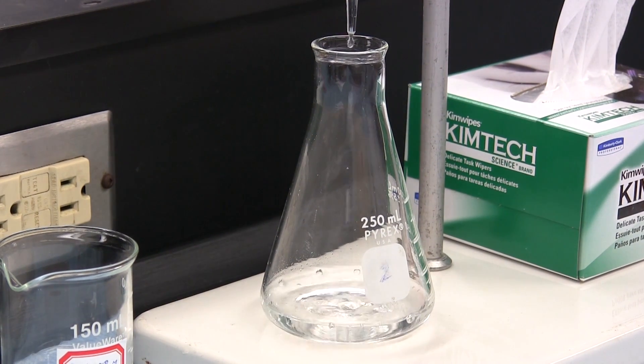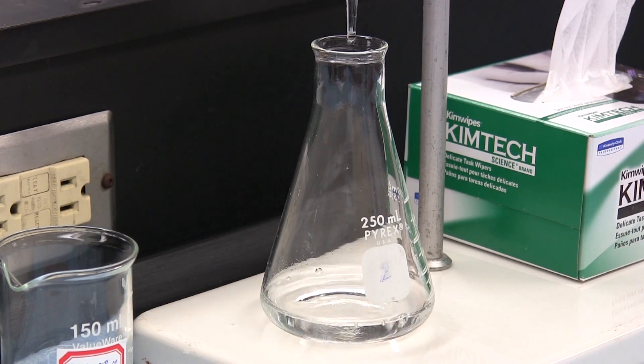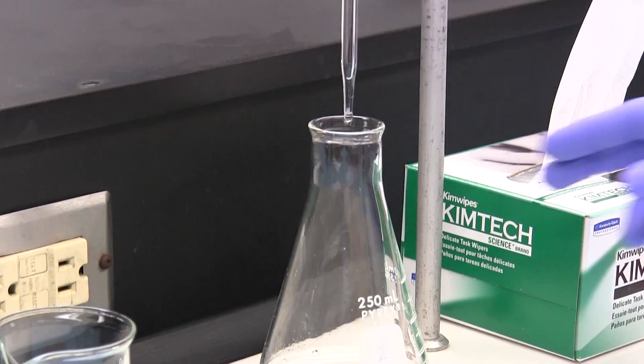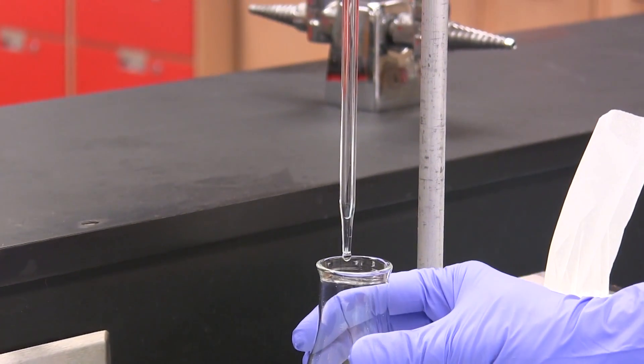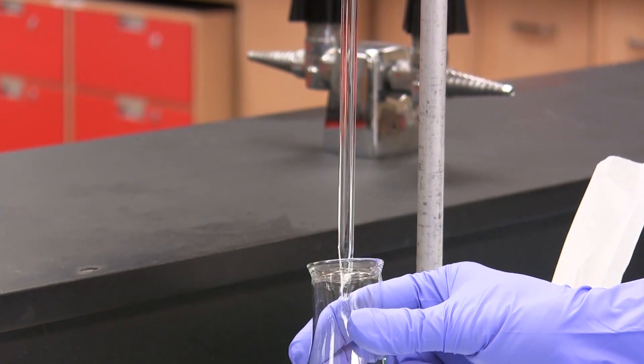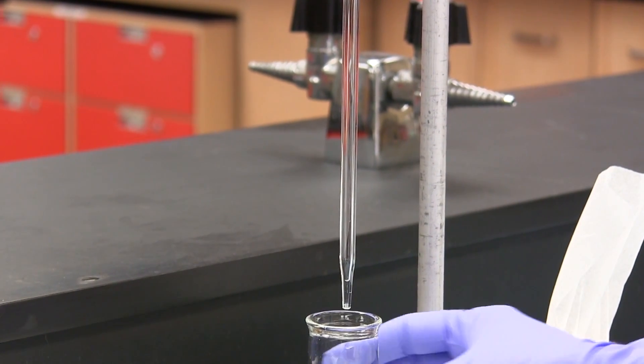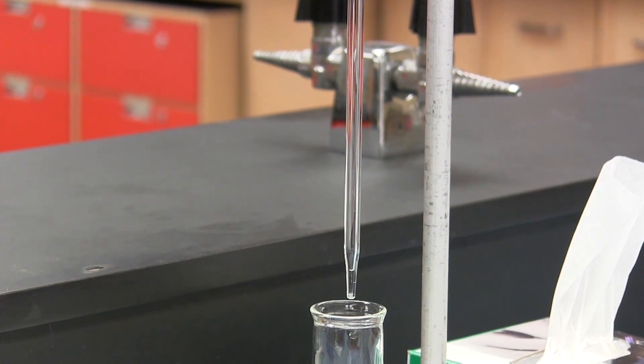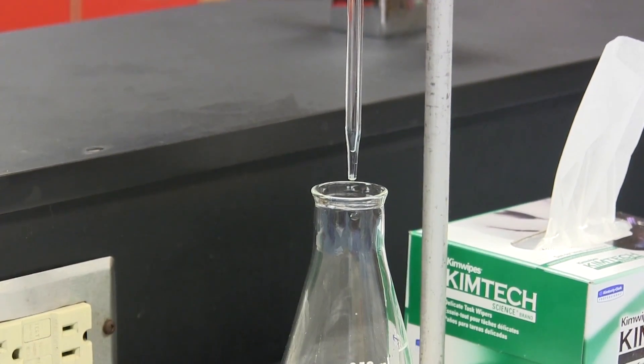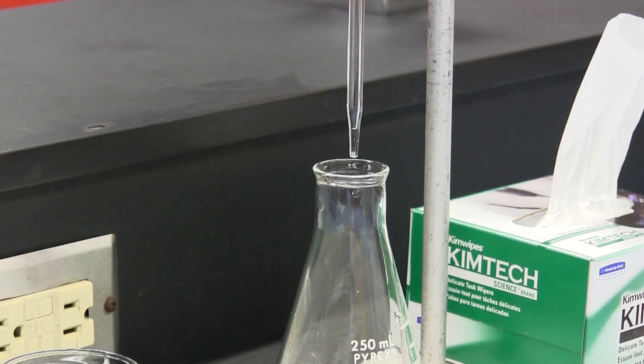When the pipette is finally drained touch the tip quickly against the inside of the receiving vessel to dislodge any droplet hanging from the tip. The transfer is complete and we can be sure that 25.00 milliliters of the liquid have been transferred to the receiving vessel.